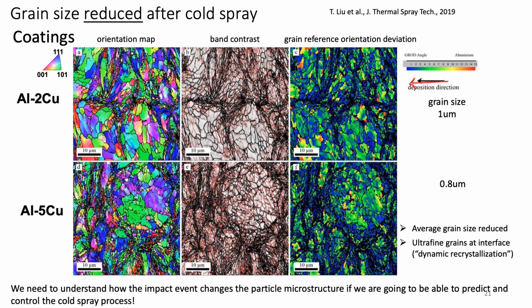We've plotted both low angle and high angle grain boundaries: 1 to 10 degree low angle boundaries, and things that are higher than 10 degrees we're calling high angle grain boundaries. And so you can see how that density of boundaries changes both between the two different alloys and with location in the structure.